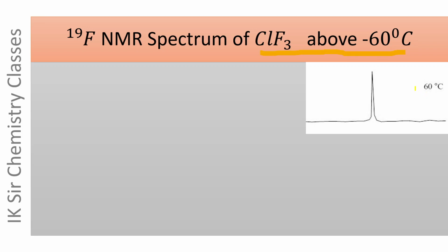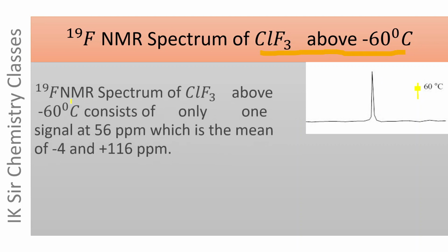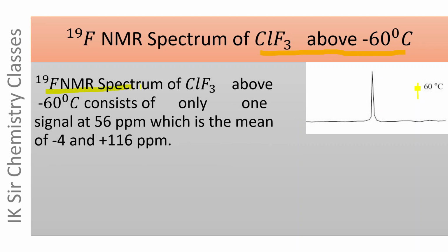It consists of only one signal at +56 ppm, which is the mean of -4 ppm and +116 ppm.